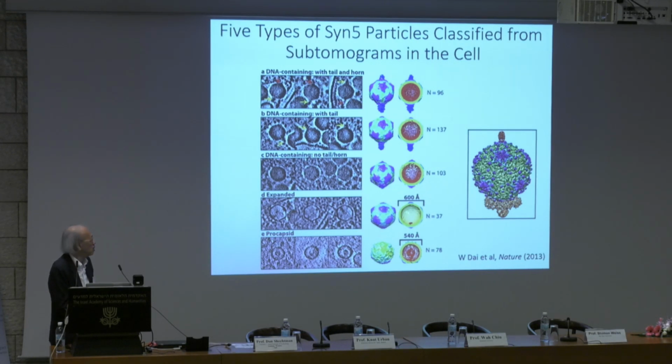So based on this, we actually see one of these in here, which we believe is the ATPase, in such a way that it will help the DNA package into the virus because it needs energy. So in fact, when we do biochemistry, we were able to only purify this biochemically. We were not able to purify the rest. So one important take-home message is, in biochemistry, you can only do so far. You can do what you can possibly do.